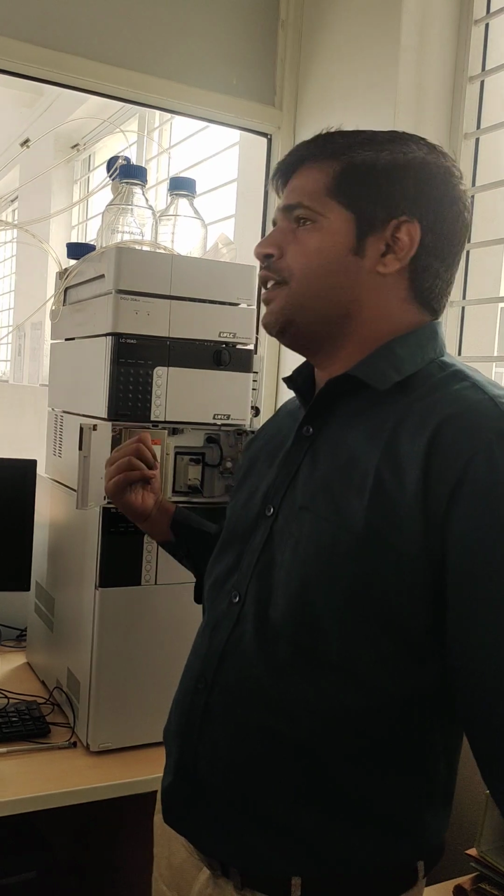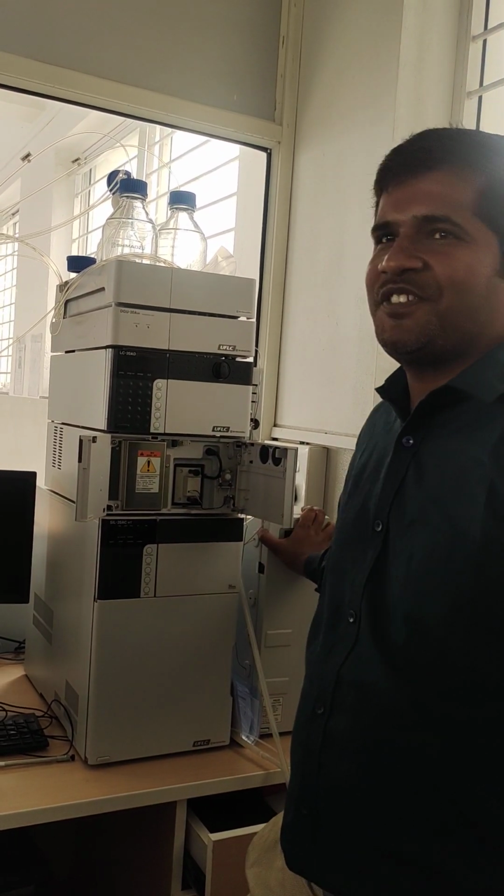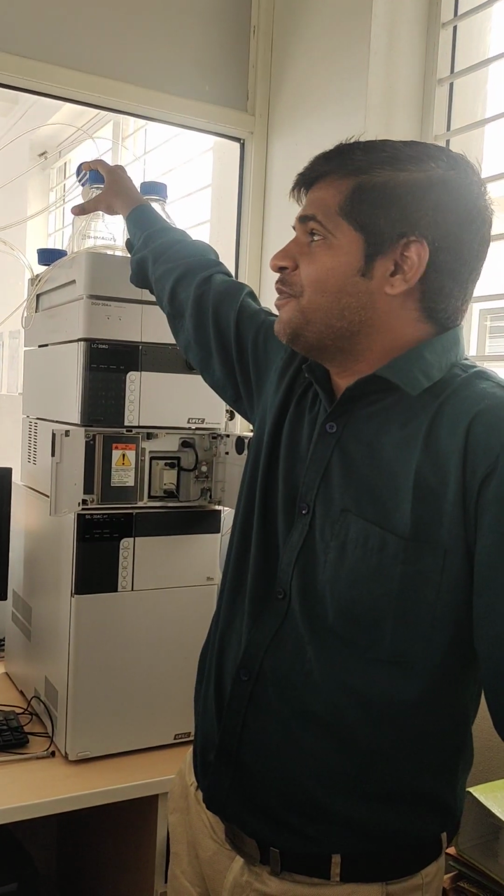So this is the PDA detector. It is a very advanced technique with us: PDA detector, sample cooler technique, column oven temperature, isn't it? Then there are 4 ports available at the mobile phase reservoir: A, B, C, D ports. We can use 4 types of mobile phase, 4 types of solvent, here.